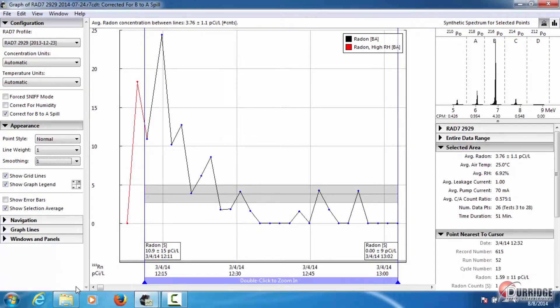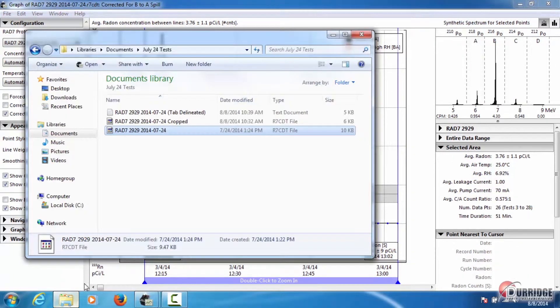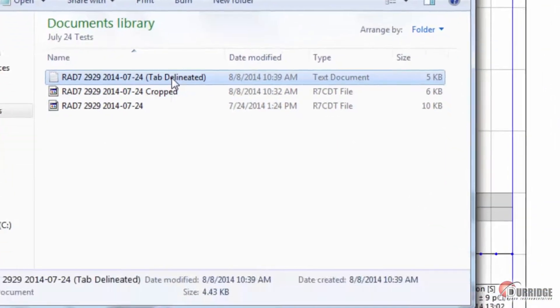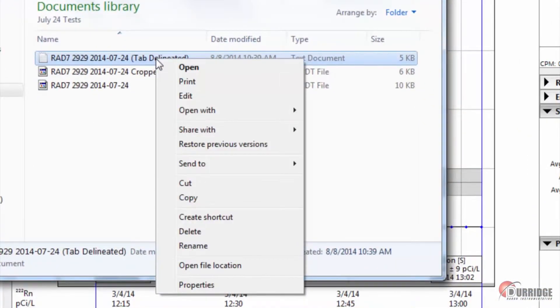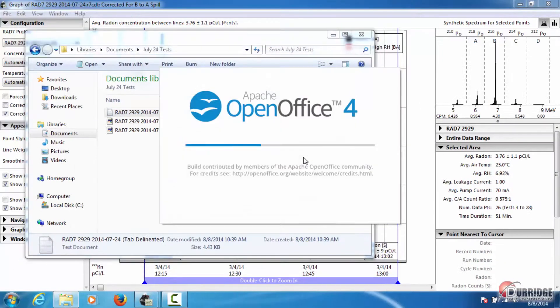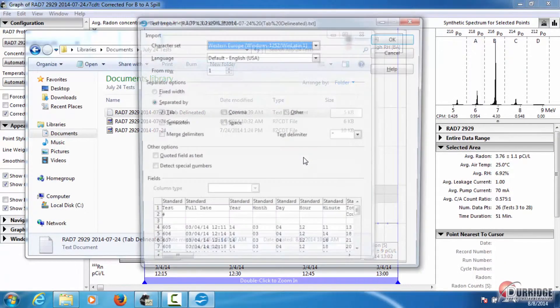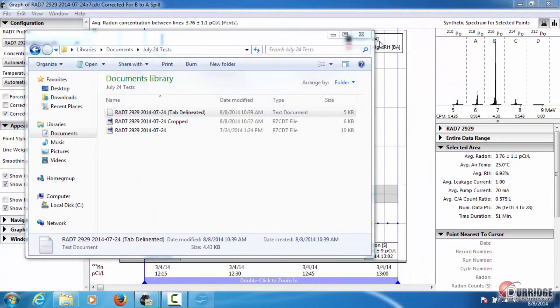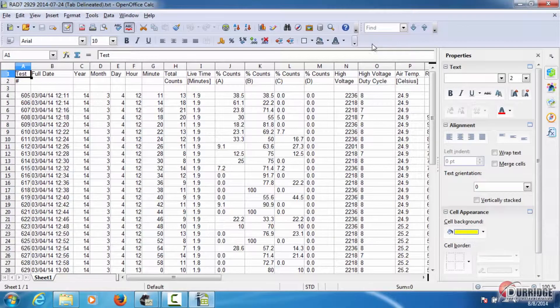If we find the file labeled Tab Delineated, right-click and select Open With, then choose your spreadsheet program. The file can then be imported into the program.